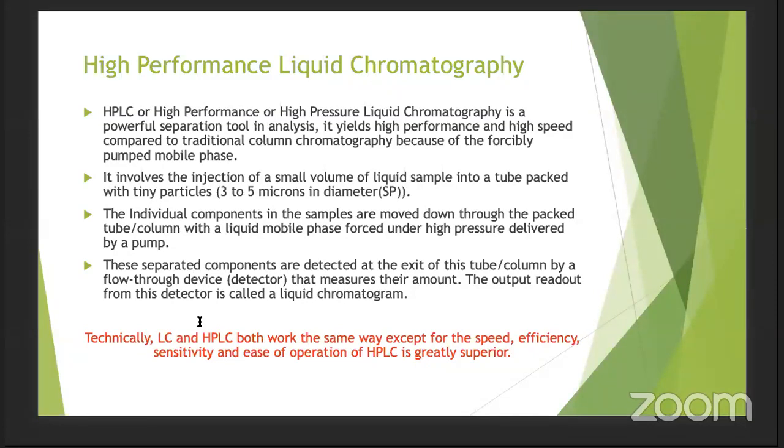So now with this done, let's talk about the components that are used in HPLC. So basically, HPLC also has a stationary phase. In HPLC, there is a column, which is a tube-like structure filled with a solid absorbent material, tightly packed. This stationary phase is tightly packed with resins, or I will tell you later that this stationary phase is silica. So it is tightly packed with silica.